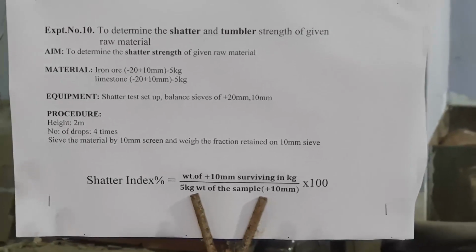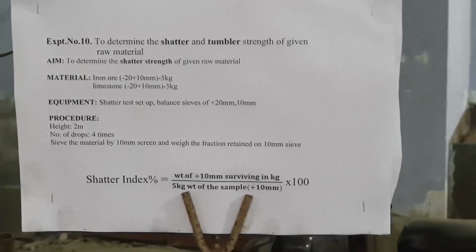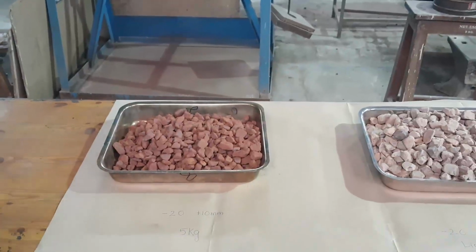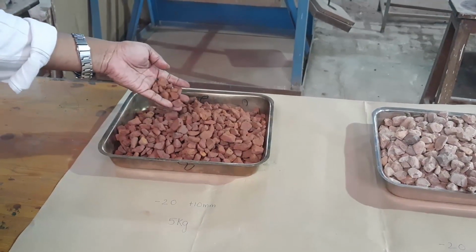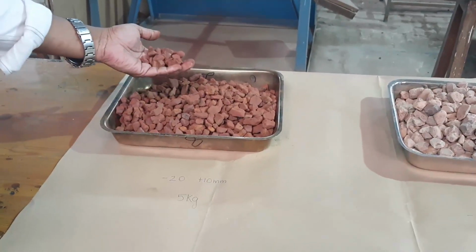Initially we are going to determine the shatter index of two types of raw material: one is iron ore, the other is limestone. Which material are we taking? This is the iron ore, minus 20 plus 10 mm. How much are we taking? We are taking 5 kg.